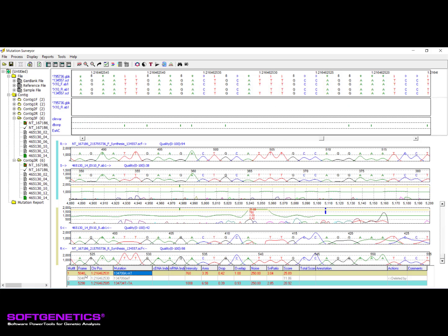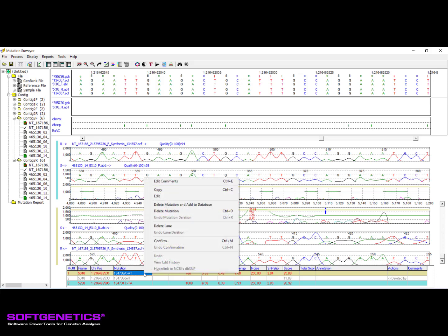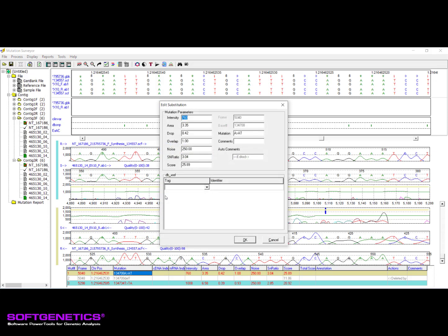Working with existing calls can be done in the bottom mutation table pane. To edit an existing variant call, right-click the call in the mutation table and select one of the options from the context menu that appears. Selecting Edit will open either the Edit Substitution dialog or Edit Indel dialog, depending on the type of call selected. Please note that a substitution may only be edited as a substitution and an indel may only be edited as an indel.